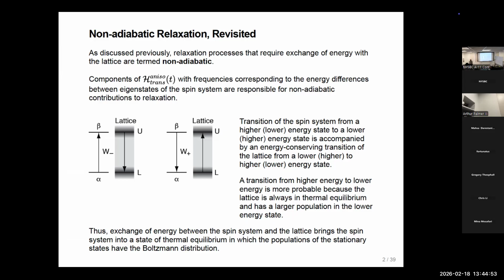this can't be completely true, but suppose I have a 180-degree pulse on the spins, and then when it comes back to Boltzmann equilibrium, after the 180-degree pulse, the beta spins are inverted.